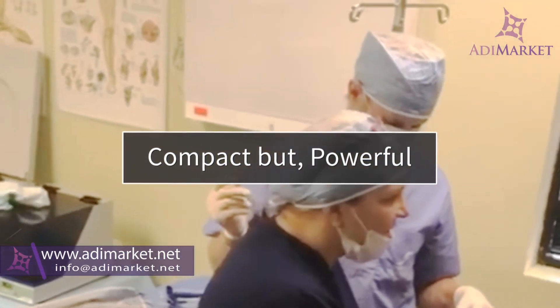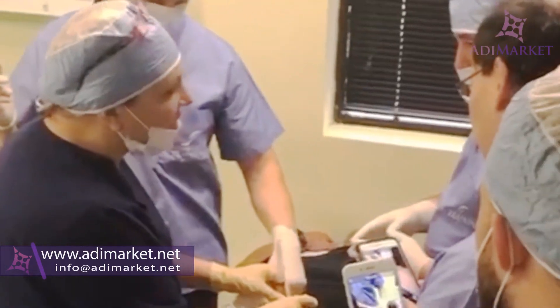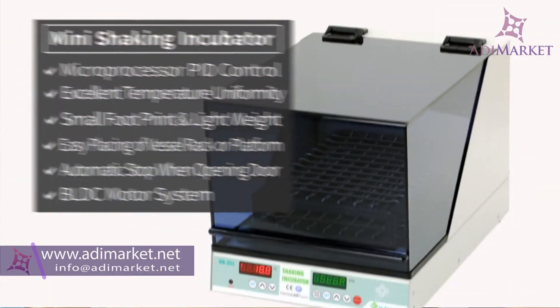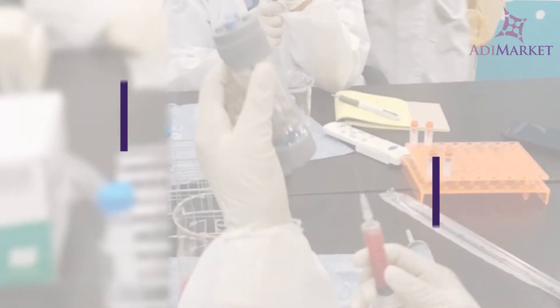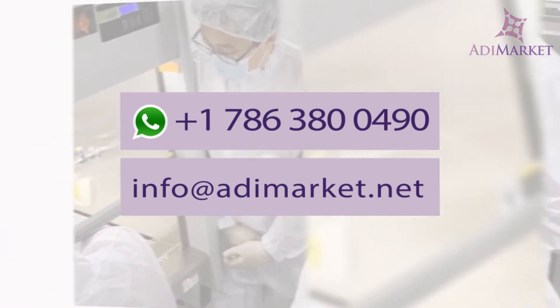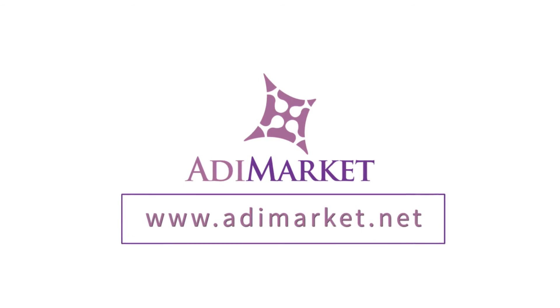This is a great investment for your office and will put you in control of the specimens that need incubating. Instead of manually shaking and waiting, you can leave the samples in the machine and take care of other patients or continue other processes. You can get one for your office today by emailing us at info@addiemarket.net or visiting our website at www.addiemarket.net.